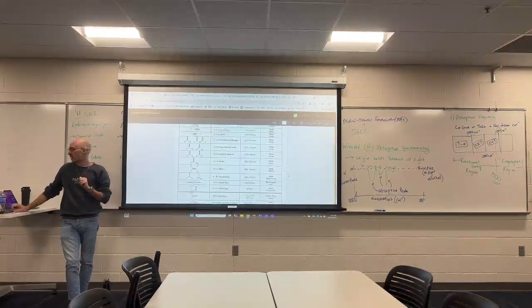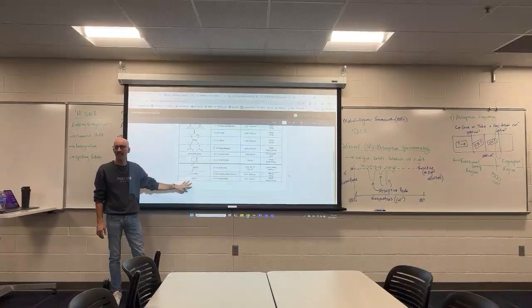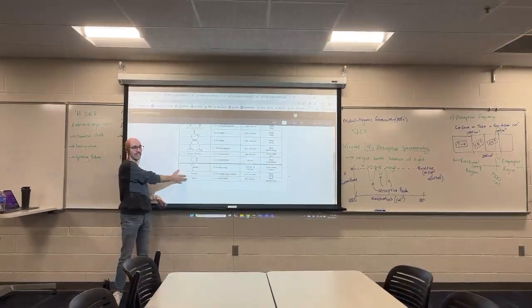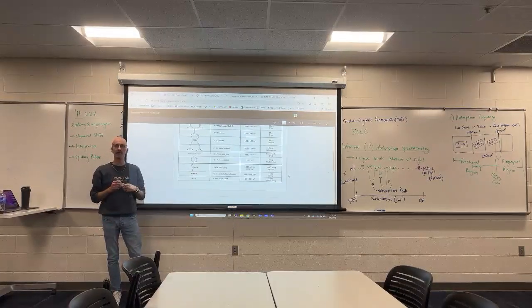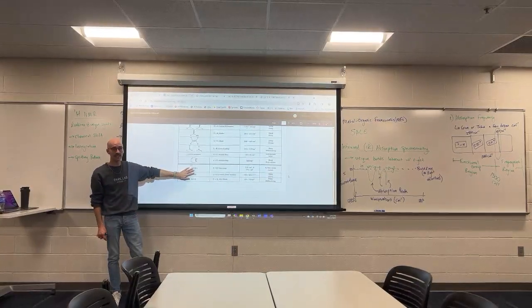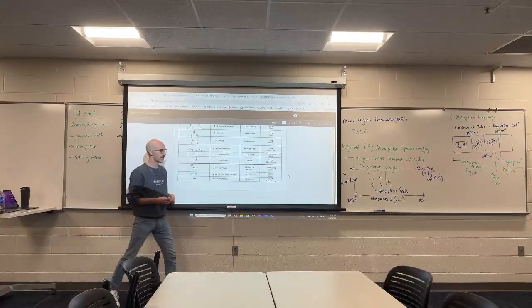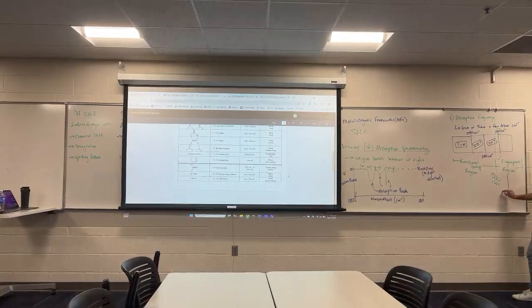The thing is, there are some bonds that only absorb in the fingerprint region, and that can make it really challenging to know if they're there at all. A lot of bonds absorb there, but these bonds only absorb there. So if you see a signal in the fingerprint, it's not easy to say if it belongs to one of these. But my table would have had to be a second page if I wanted to show you all of the other bonds that also absorb there. So this is the hardest region to correlate to a bond type.